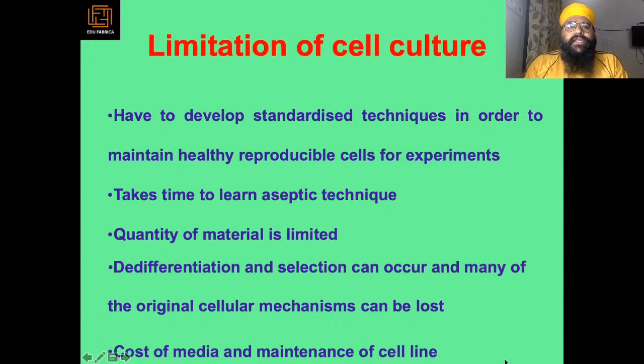Some limitations: standard techniques have to be maintained to have healthy, reproducible cells. It takes some time to learn aseptic techniques. For me, when I started working with cell culture in 2011, it took less than a month, maybe half a month, 15 days, to get used to it, because then it becomes your routine.